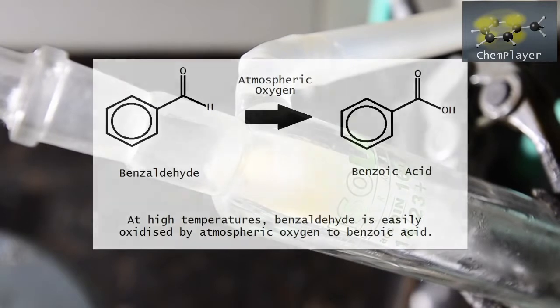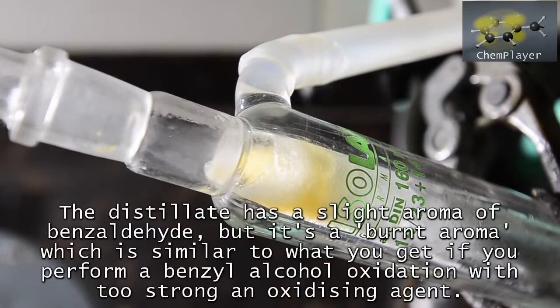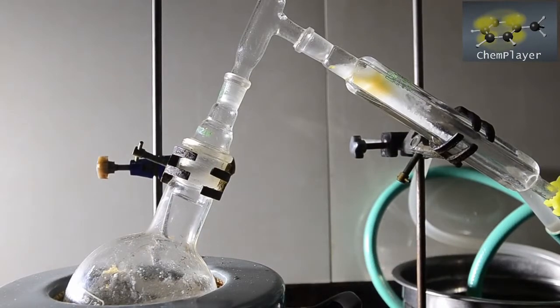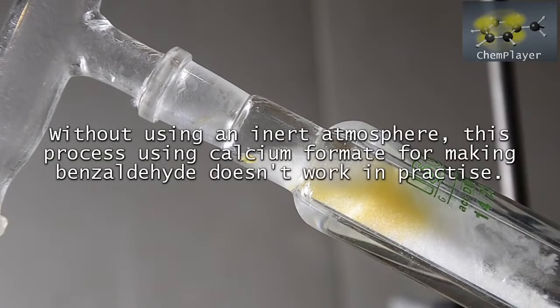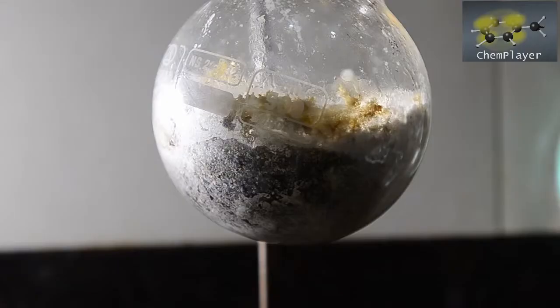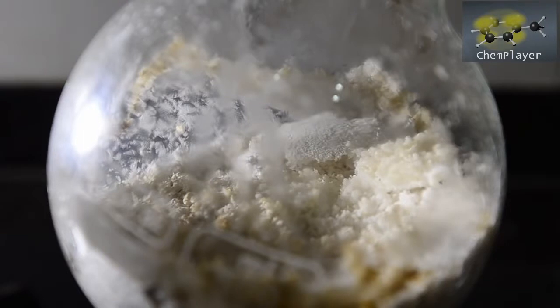The distillate has a faint aroma of benzaldehyde, but it's like a burnt version. So our first experiment is a failure. Unless you've got an inert atmosphere, you can't make benzaldehyde via this process because the heat required simply decomposes it. So we allowed the reaction mixture to cool down, and luckily our flask was still intact and not too hard to clean. So let's try again.